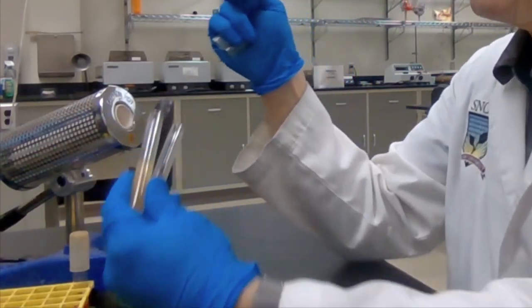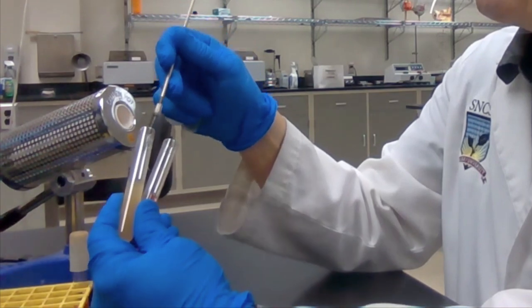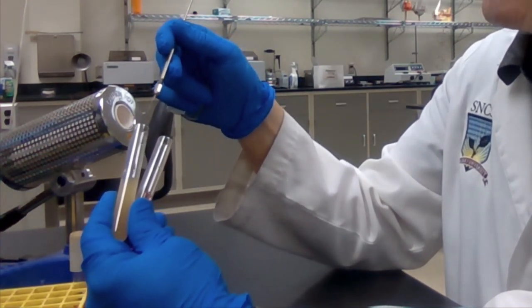Mouths of tubes are flamed and bacteria are transferred from your unknown culture, the inoculum, to the sterile medium.